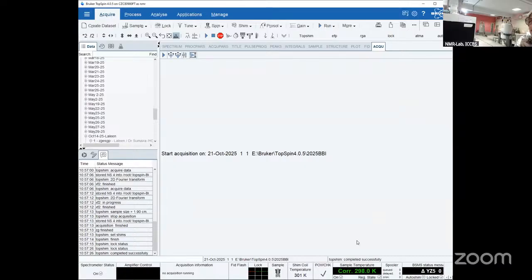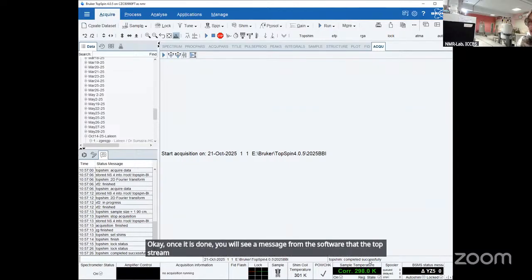Okay, once it is done, you will see a message from the software that the process has been completed.